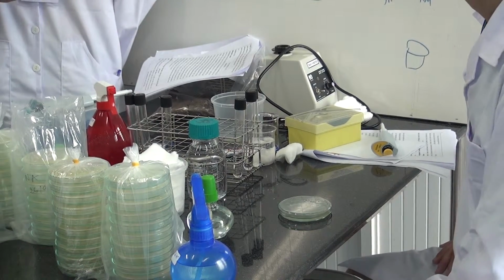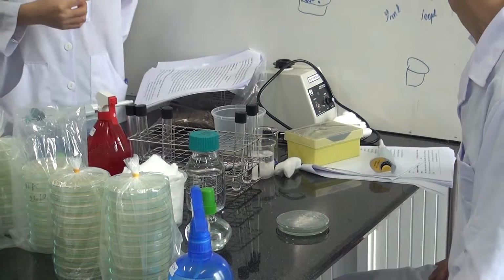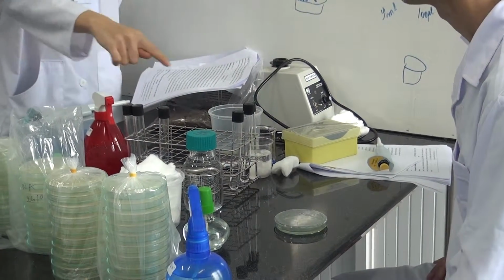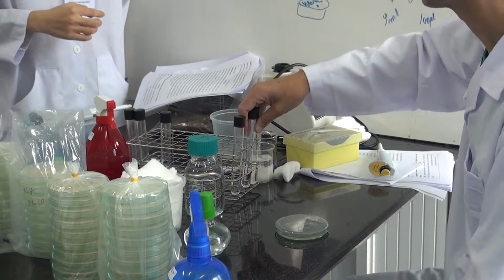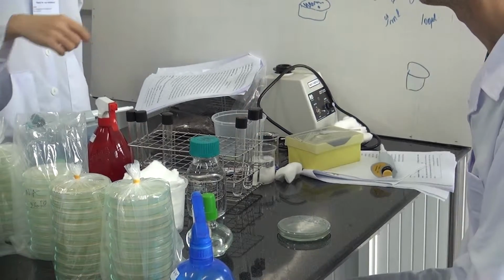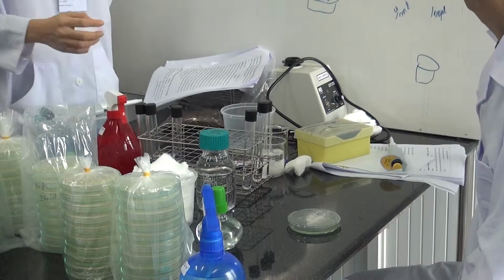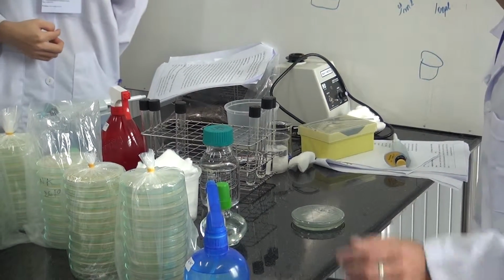How many group of the dilution tip? How many dilutions? Group. How many group of the dilution tip? Per group. How many dilution tip per group? Just one. Each people can. How many samples for each?